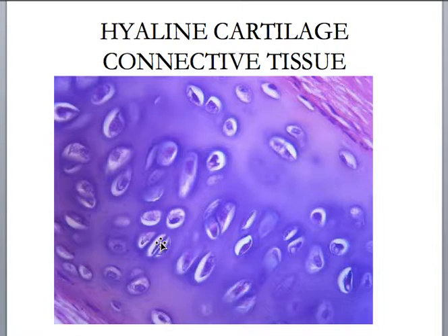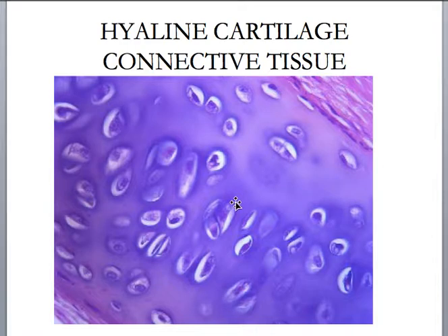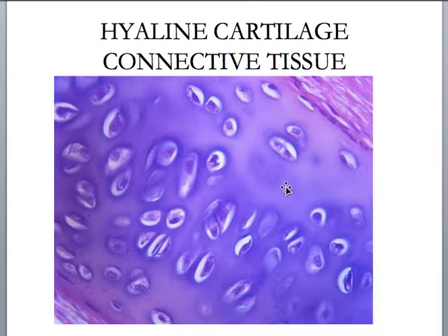Hyaline cartilage. Cartilage is a highly specialized form of connective tissue. When you look at hyaline cartilage, I think it looks like — if you've ever seen Smacks cereal, you know, with the little frog on the box — it looks like a little Smacks cereal. Hyaline is very glassy in appearance. When you go in and out of fine focus, you can really see the glassiness of this hyaline cartilage.